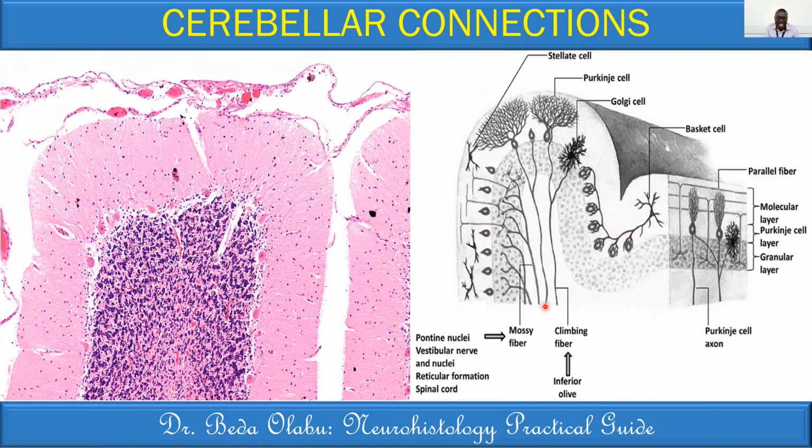This is the lobe that is related to vestibular function. So it's the vestibulocerebellum, otherwise known as the archicerebellum. Then the Purkinje neurons from the vermis region, paravermis region, anterior lobe and the tonsils project largely to the globose and emboliform, and they constitute the paleocerebellum.